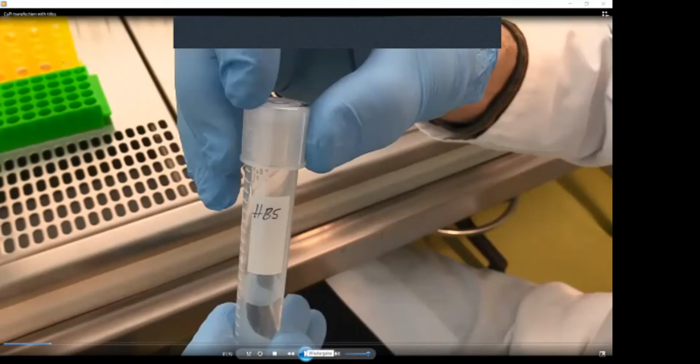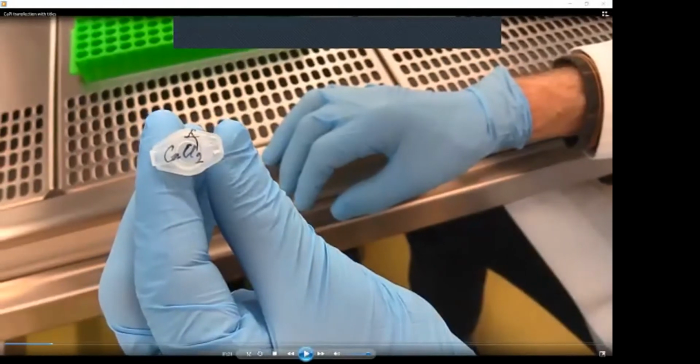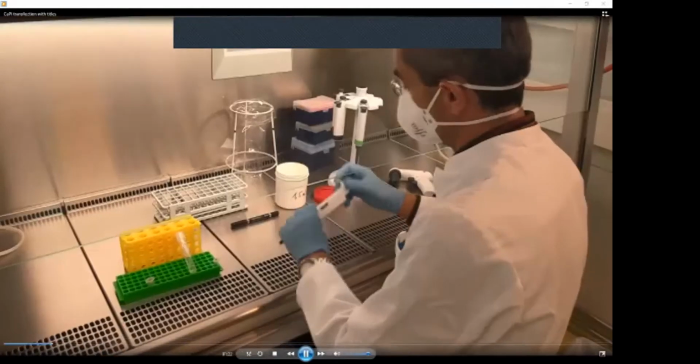This solution is aliquoted at -20 degrees, and each aliquot is used only once. The second important part of the system is calcium chloride, which is also prepared by the experimenter, aliquoted at -20, frozen, and used only once.